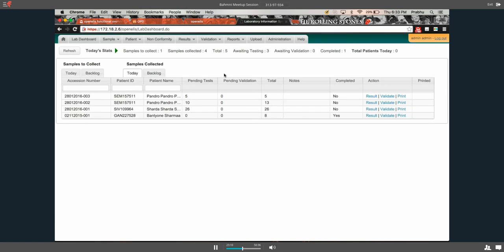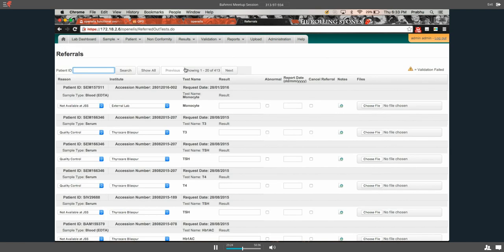Now there's a section called results where I have a selection of referred out tests. If I go there, I can see that the test that I had just referred out for this patient, and for this accession number, is available here.